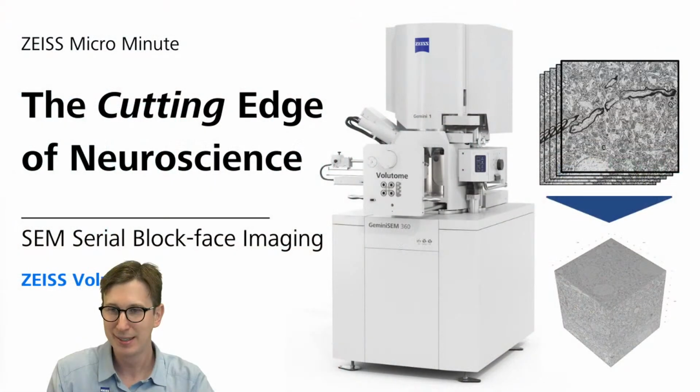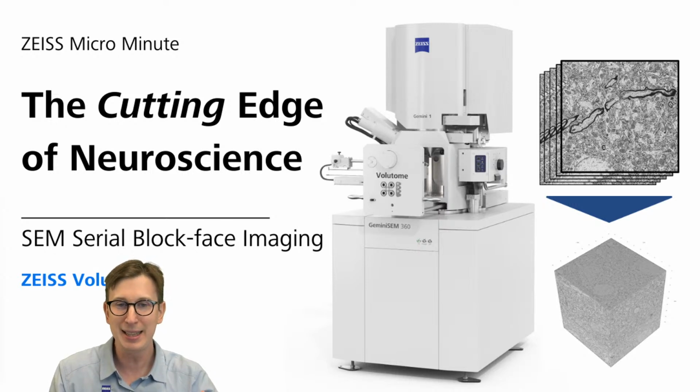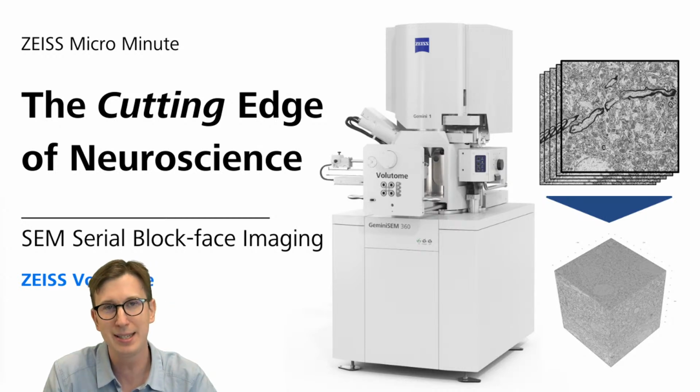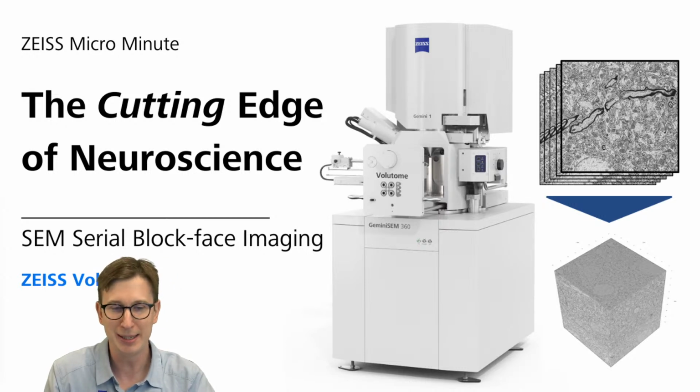What we're here to talk about is the cutting edge of neuroscience. Now, this is a bit of a pun that hopefully you'll understand here in a second. And this technique that I want to teach you about, which has become huge for neuroscientists today, is serial block face imaging in the scanning electron microscope. So what does that mean? Let me explain.